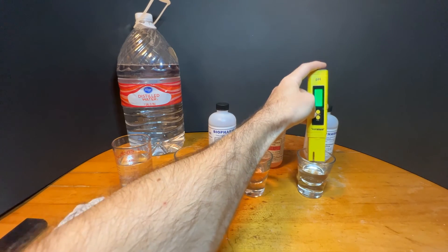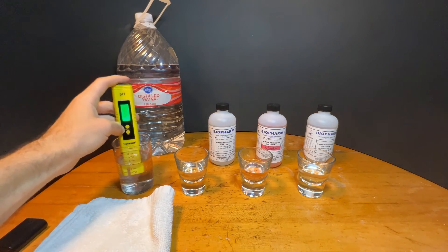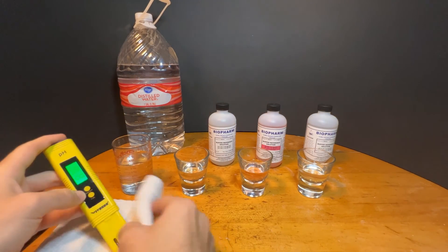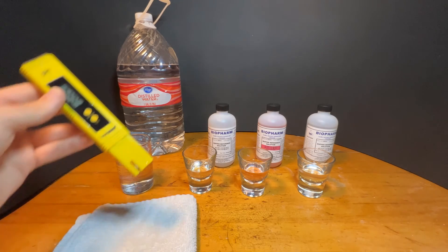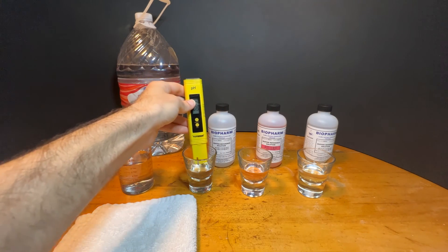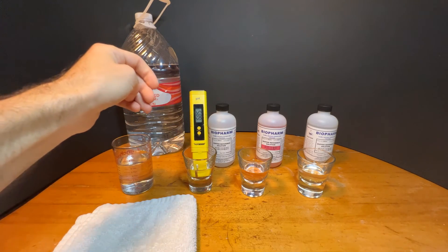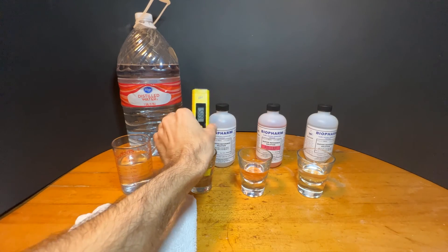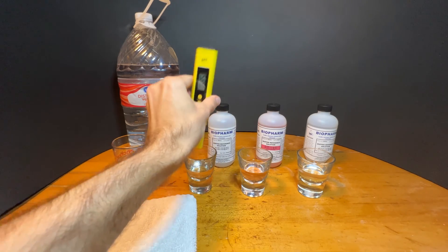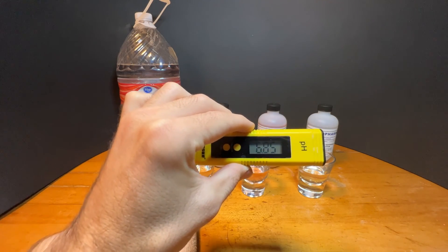We'll take it out and rinse it off in distilled water. With all three points calibrated, I like to go back to the first 6.86 calibration solution and see what the meter reads. It should come up pretty quickly. Our meter is reading within one one-hundredth of the original solution at 6.85. That's an acceptable reading.